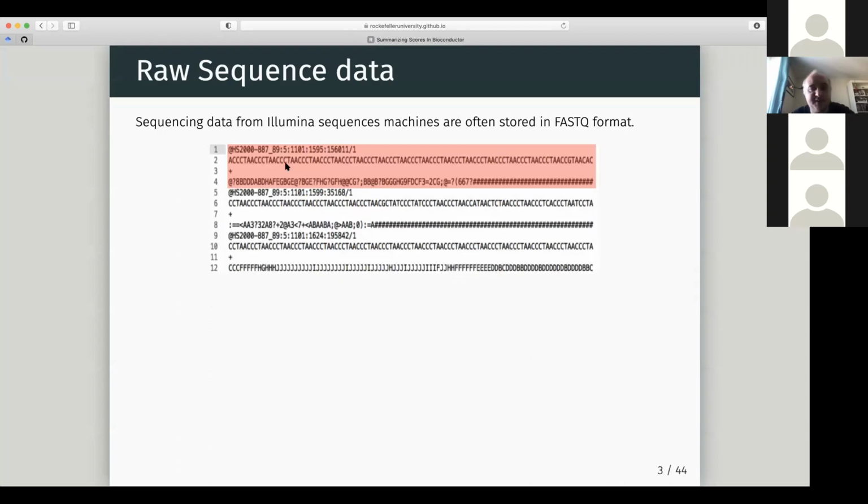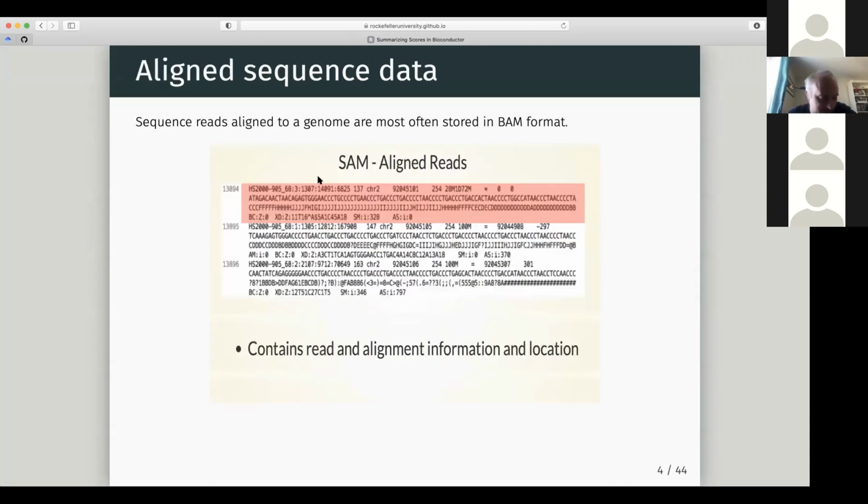This is our raw format, our ID, our read sequence, and our ASCII encoded Phred quality scores. Remember, hash is really bad. We saw that we can take our reference genome, our FASTA, take those FASTQs, index the reference genome, and use our aligner, Subjunc, or whatever you really want to use. HiSat2 is good. And we produce a BAM file, hopefully, but a BAM file is just the computational equivalent of a SAM file. And this read we would have here will get turned into an aligned line here.